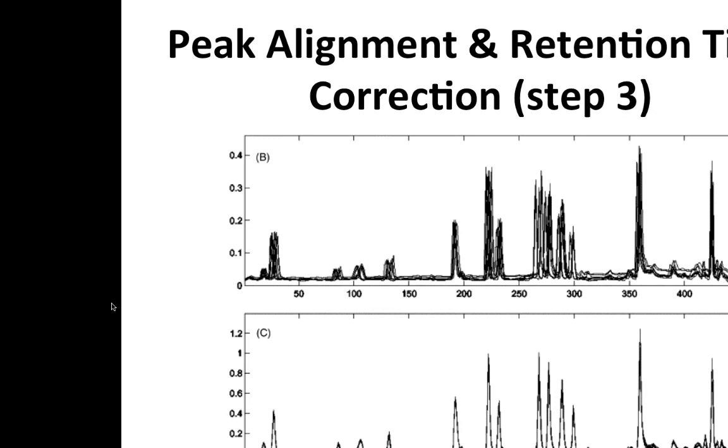For a plot like this, it's all your data points. You plot them over a range, in this case it's MZ. Whatever you order and plot, you can generate a plot like this. But this is not offered in XCMS by default, although it's relatively easy to do if you know R. You just get all the data points and plot them. If you order them, it naturally forms these curves. So it is no magic. You just need this high density plot, and it will show up like this.